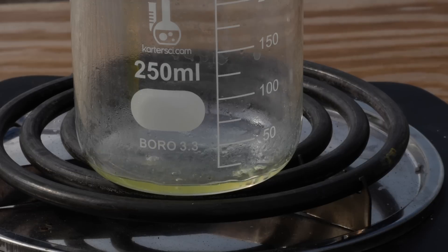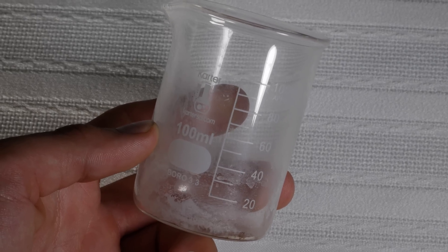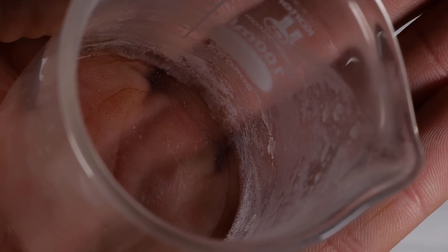Well, kinda. Unfortunately, caffeine sublimates at 178 degrees Celsius. So that means that by heating it up, it goes directly from a solid into a gas. Luckily, some of that caffeine appeared to condense on the sides of the beaker, but we definitely didn't extract all 54 milligrams.